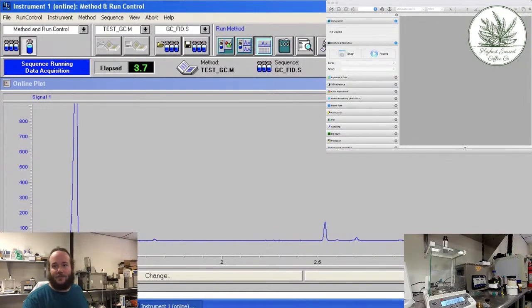Okay, that's done. So hopefully that'll fix it. The tower is just slightly off center. So when the grabber goes to grab the bottle, it's like missing it just slightly.